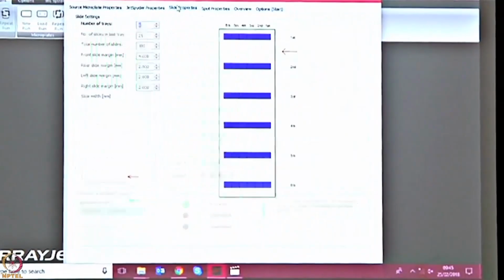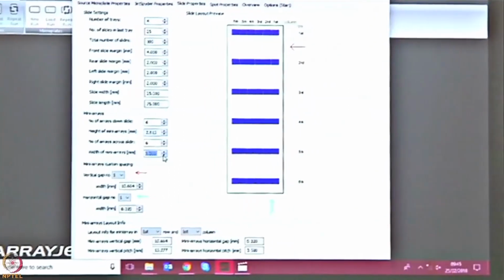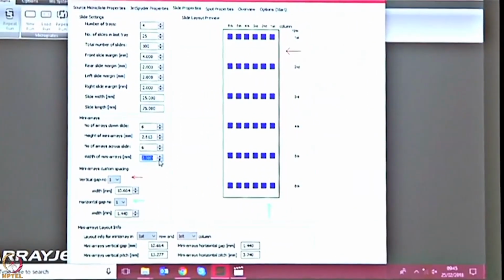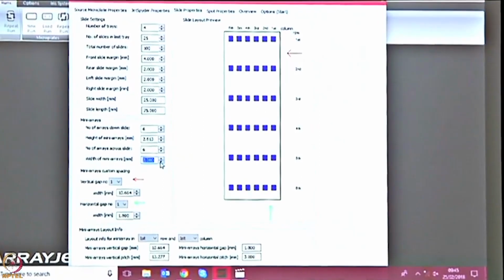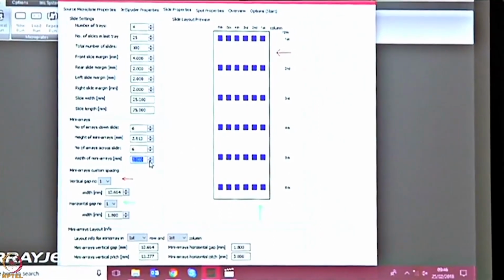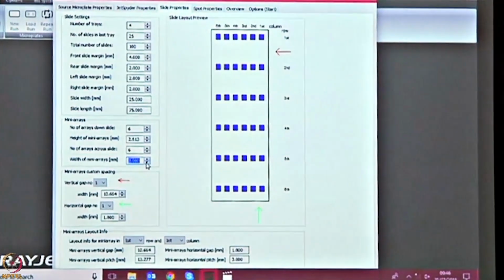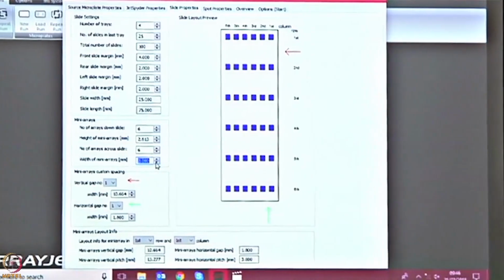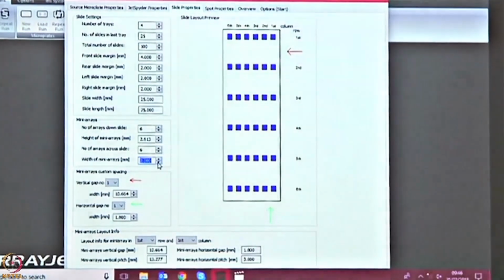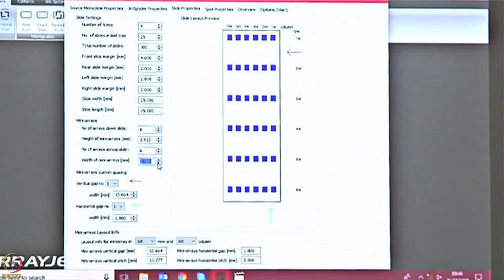So that's my 11, and now from one slide, let that be a blank slide, but from my blank slide I have made many identical assays. Each assay contains 22 samples.